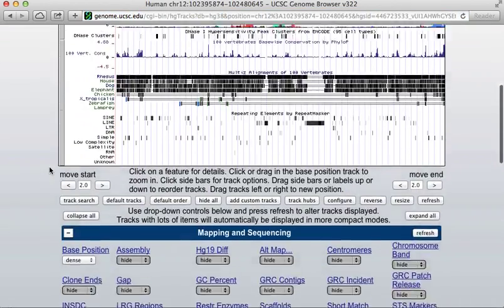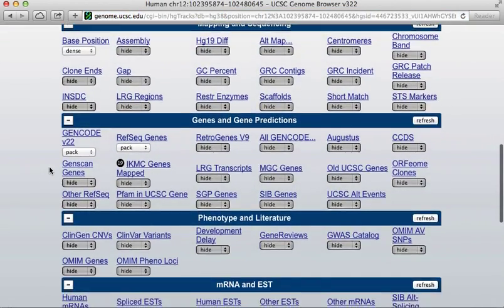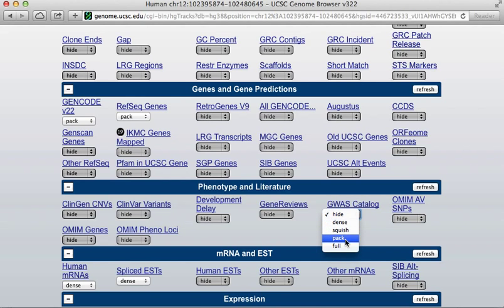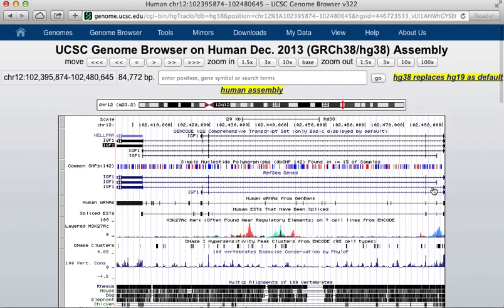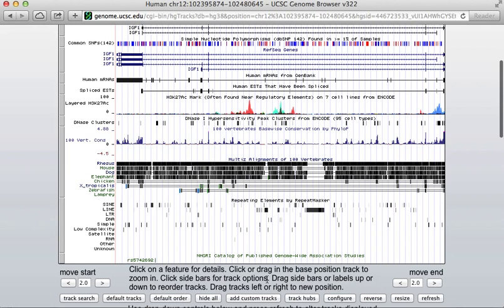I'll show you one more thing. You can also go down below, and there are many other tracks with all kinds of other information that are currently hidden. I'll display one of these — this GWAS information — at the pack level. And I'm just going to hit refresh to add that track to my browser. This one will show me any SNPs that were found in genome-wide association studies as being relevant to some human phenotype.